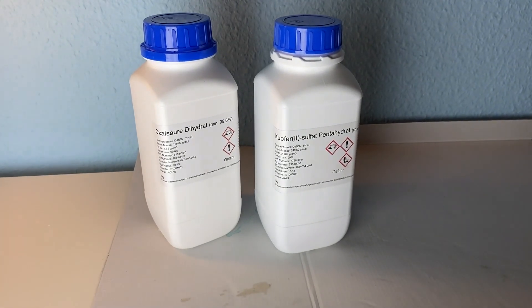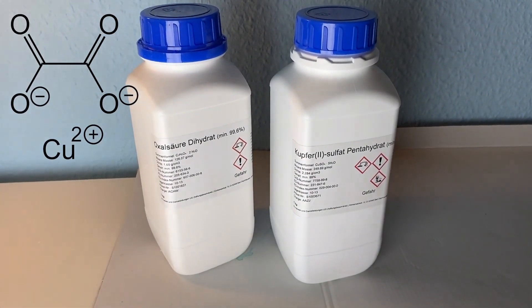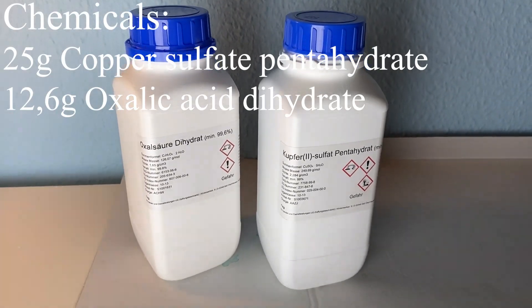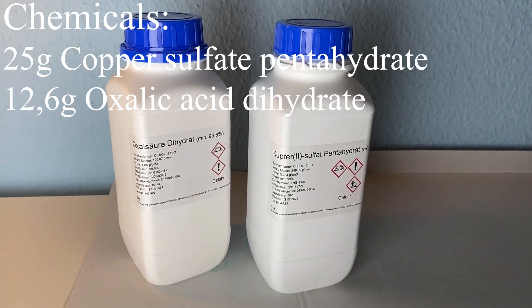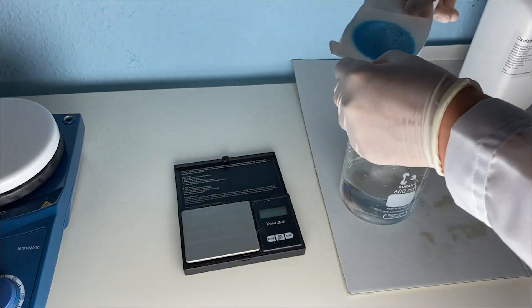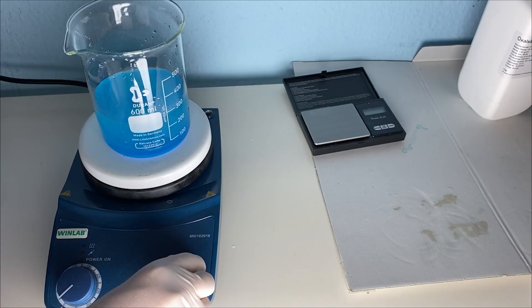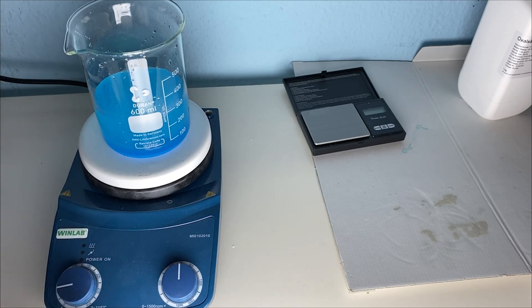Today I will be making copper oxalate, which is a light blue copper compound also used as a catalyst. For this reaction we will need 25 grams of copper sulfate and 12.6 grams of oxalic acid. I will start by measuring out the copper sulfate and then dissolving it in 300 milliliters of distilled water by putting it onto the stir plate and heating it slightly, because the copper sulfate is always hard to dissolve.